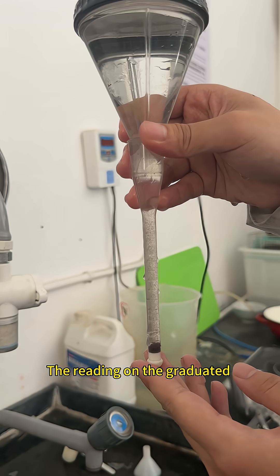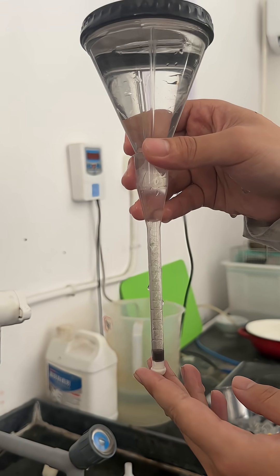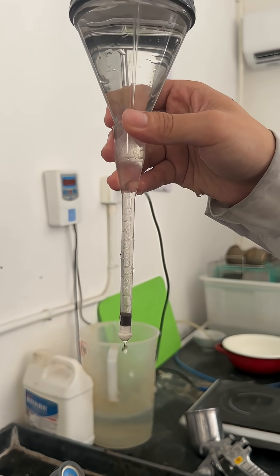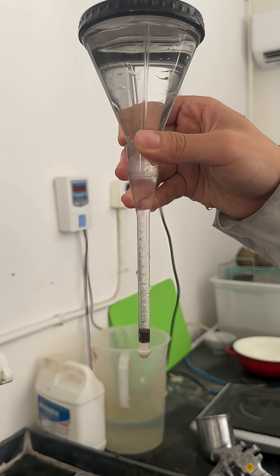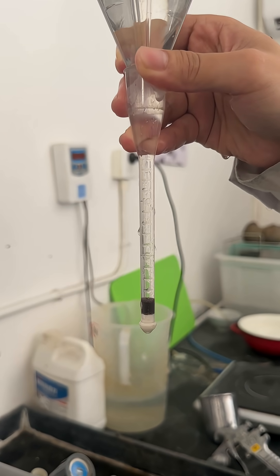The readings on the graduated tube at this point indicate the fineness of the glazed slurry.